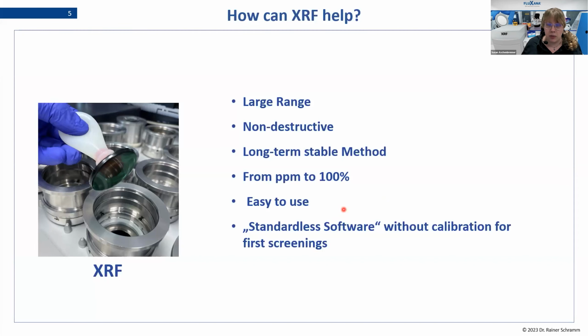And in my opinion, one of the biggest advantages of XRF for recycling applications, and in general for applications where we don't know from the beginning which kind of material and component we are dealing with, is the standardless software packages. Most of the XRF devices come with so-called standardless software.